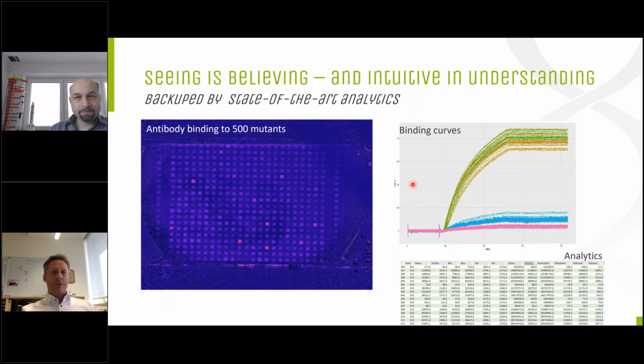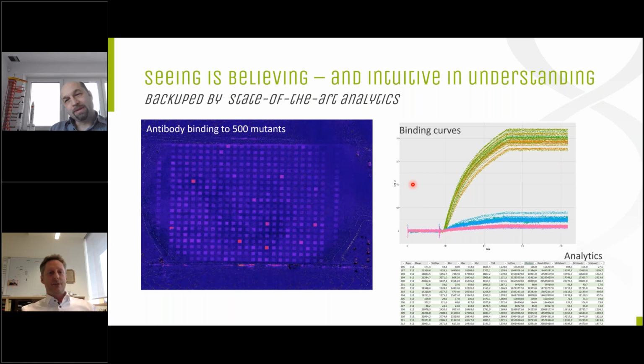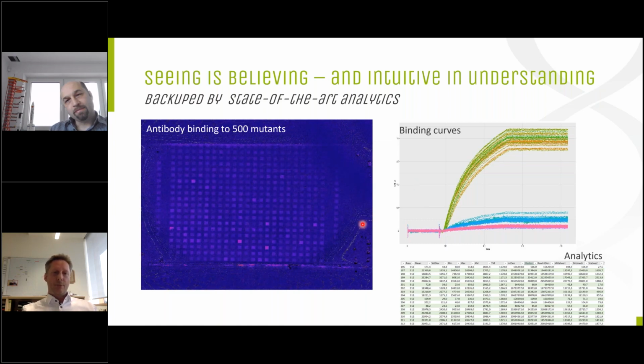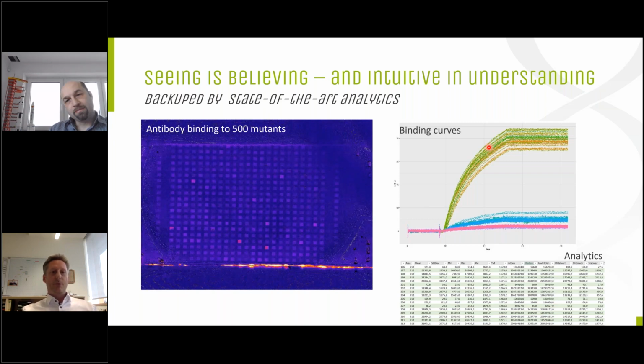And it's really working. What you see here is a movie taken with a camera which really sees these interference intensity changes on a microarray surface. We see here the binding of an antibody to 500 different spots of a microarray on a surface in false colors, of course, because it's label-free, it's no fluorescence, and because it's time resolved, we can extract from this movie for each individual spot a binding curve, a sensorgram. We see the association phase, we see the dissociation phase, and for some experiments, we also can regenerate surfaces.